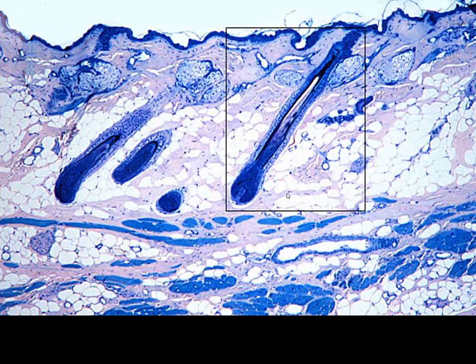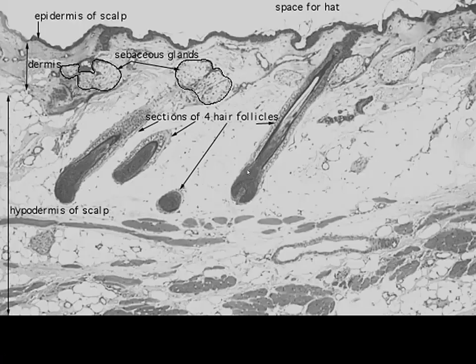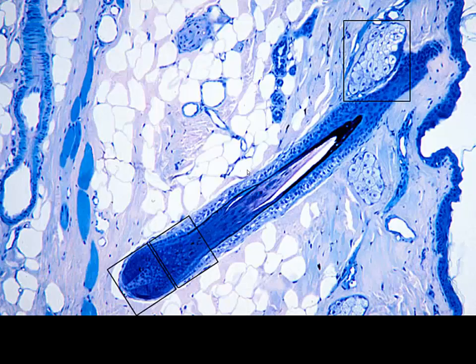And then here's our much more familiar longitudinal section. Again, hair follicles, hypodermis where we have adipose tissue. We can even in this one see the bulb of the hair, and there is our dermal papillae projecting up. Shaft of the hair, which would mean this is going to be our internal and external root sheath that remains on the outside here. And glassy membrane, the very outermost layer of our hair follicle. We'll see more of those as we get higher and higher mag.